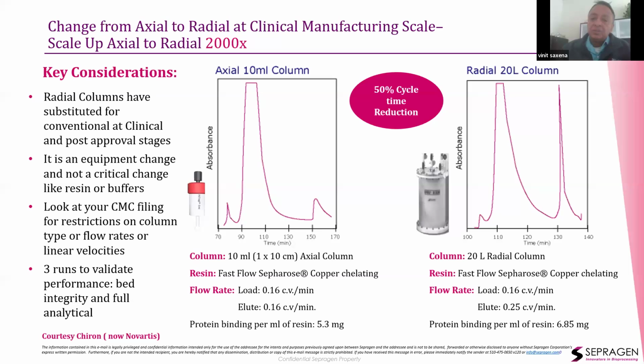When they moved, the manufacturing guy wanted to switch to radial flow because they wanted the entire process to be done in one shift. They'd had several problems with the night shift in terms of loss of batches, and he didn't want to incur that. But initially, this was 15, 20 years ago. Actually, more than 20 years ago.